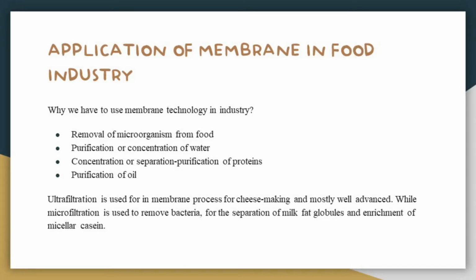Application of membranes in the food industry. Why do we have to use membrane technology in industry? First, removal of microorganisms from food, purification or concentration of water, concentration or separation and purification of protein, and last but not least, purification of oil.